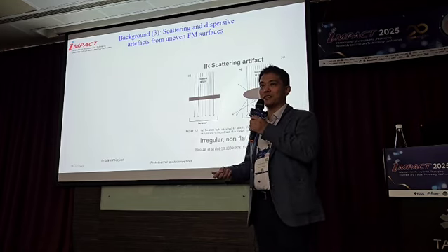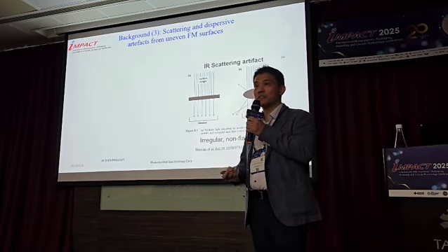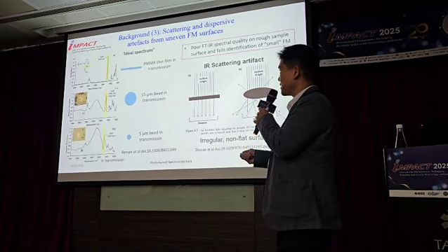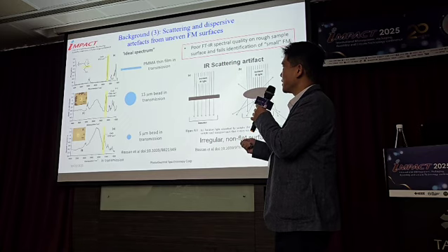There's also the fact that a lot of times when we prepare the samples, they can be pretty rough on the surface. The surface scattering of the IR light contributes to some of the distortion artifacts that we see. So for instance, we have PMMA: when it's made in a flat film like this, it's quite straightforward to get an IR spectrum that we can readily identify.